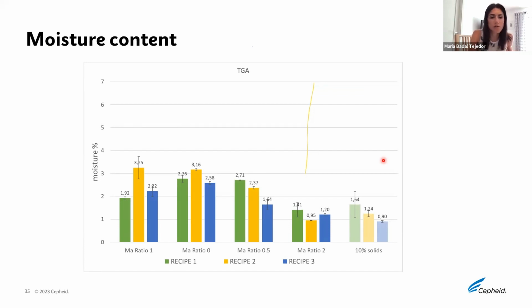There was no clear correlation telling us that some formulations trap less moisture than others, or that one cycle is better than another at removing moisture. What perhaps needs to be adjusted is the secondary drying, to make sure that the moisture content after drying is reduced to the minimum possible.